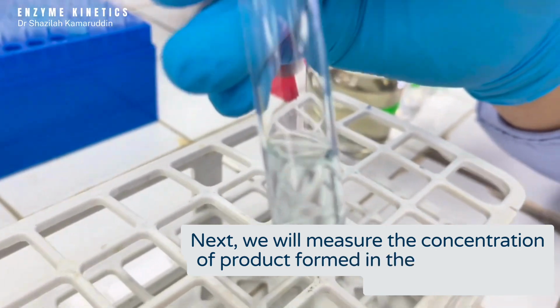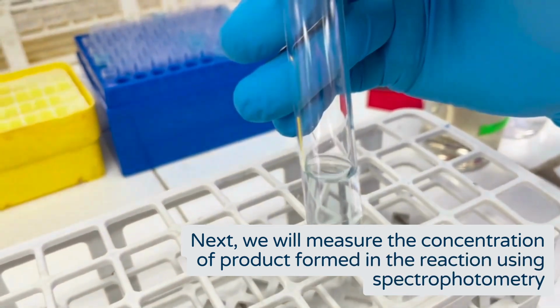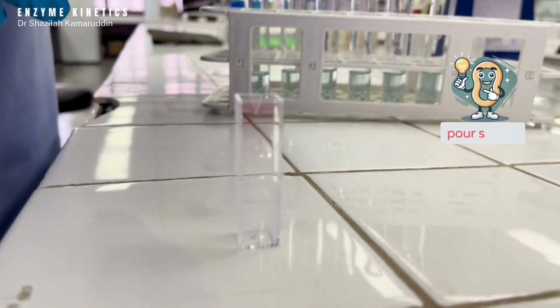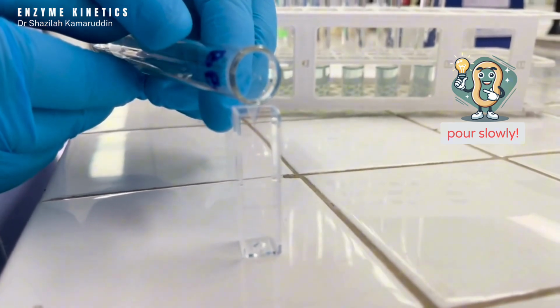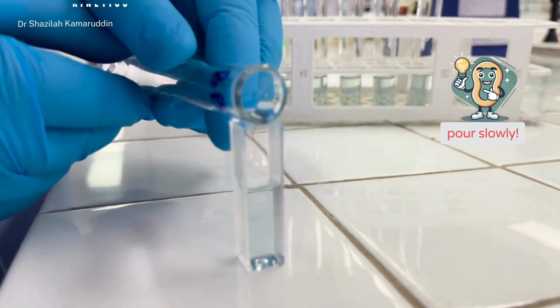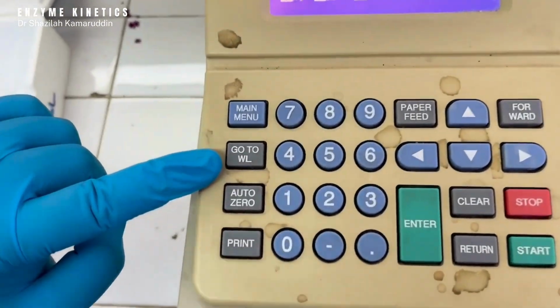Next, we will measure the concentration of product formed in the reaction using spectrophotometry. Take a 3 ml cuvette and carefully transfer all the solution from your test tube into it. Avoid creating any bubbles. Set the wavelength to 660 nanometers on the spectrophotometer.